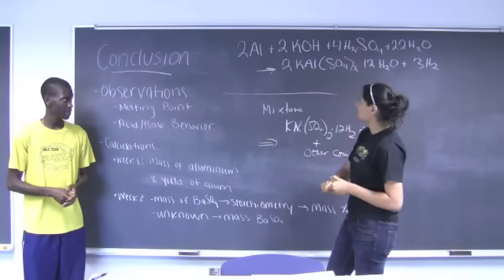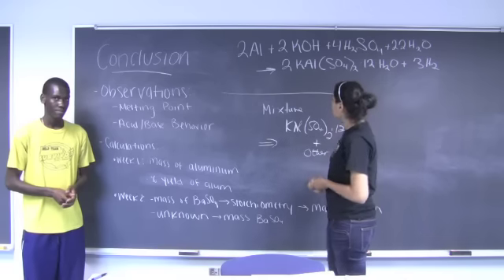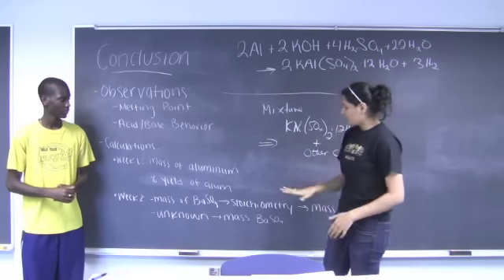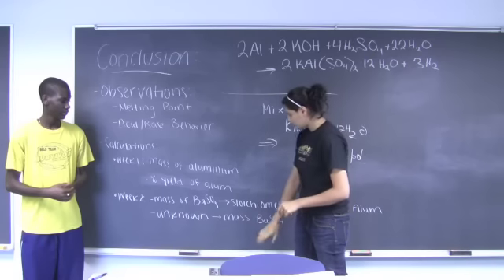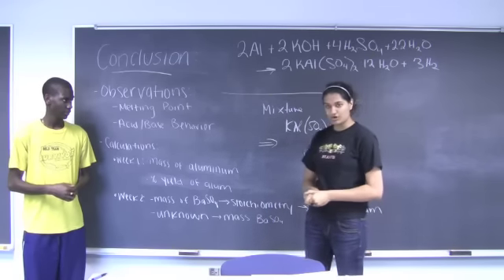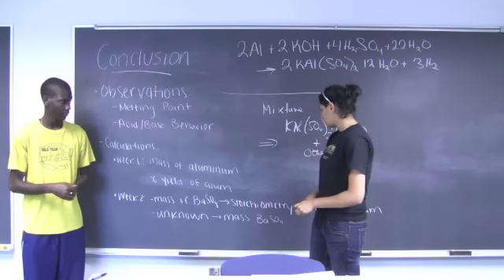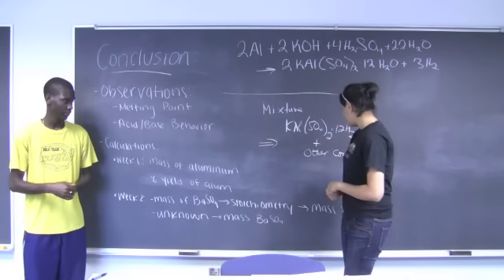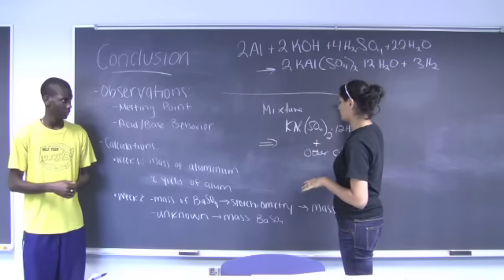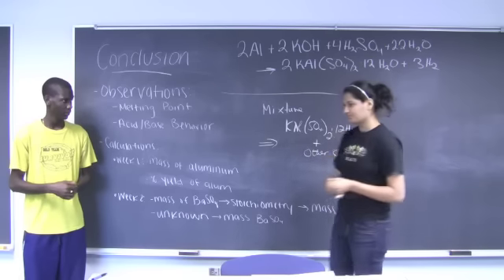When you do this, you're going to refer to the equation on the first page of your lab packets. It's the overall balance equation. However, when you're determining the calculations from week 2, you're going to take the mass of the barium sulfate from your unknown, and you're going to use stoichiometry to determine the mass percent of the alum. When you do this part, you do not use the overall equation, you use just the mixture.